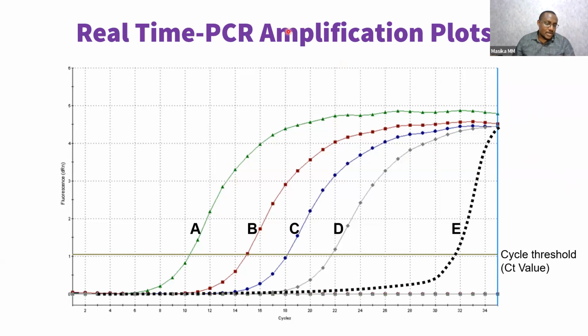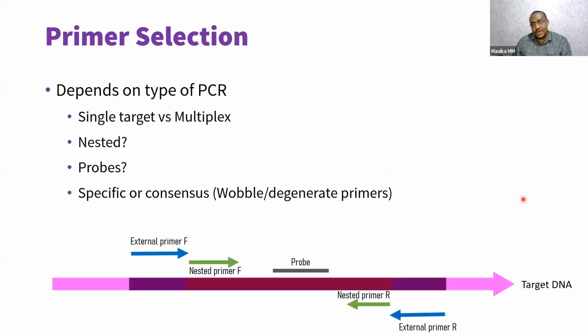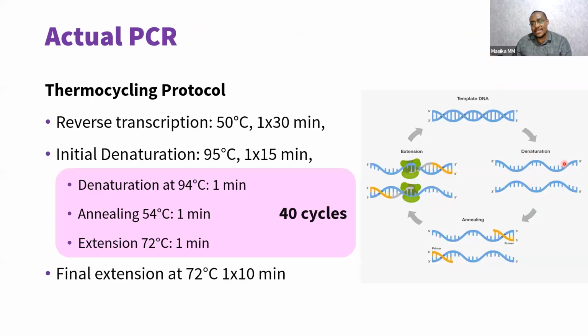Okay. So how come the double-stranded DNA denatures at 94, yet the denaturation step occurs at 94? Yes, the reason we are taking this to 94 is so that we can denature double-stranded DNA. Why? Because the primer will only attach to a single strand, and the polymerase will only extend a single strand. It does not happen when the DNA has not denatured. So when the DNA denatures, it denatures at 94, and that means you have split.